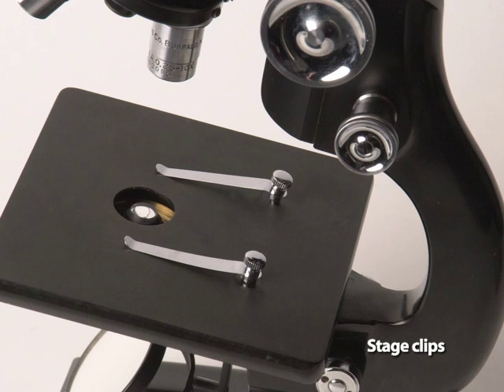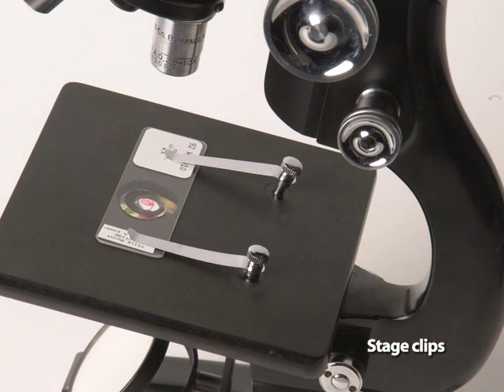Stage clips are often used on stereo or simple compound microscopes to hold a microscope slide on the stage and yet allow you to move it manually.